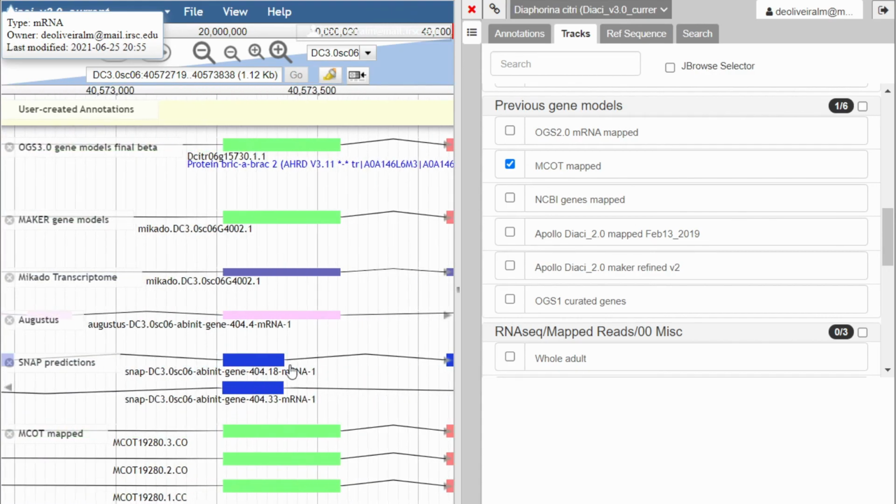See here you have the shorter exons. So by looking at your RNA-seq and comparing it with orthologs, you can use them to get the best version of the gene. And sometimes maybe two models are just as valid. So maybe you have isoforms, which are the same protein, but just spliced differently. Sometimes that occurs as well.